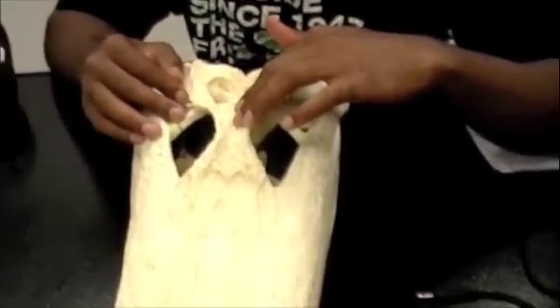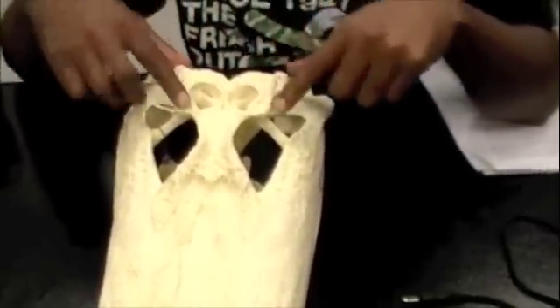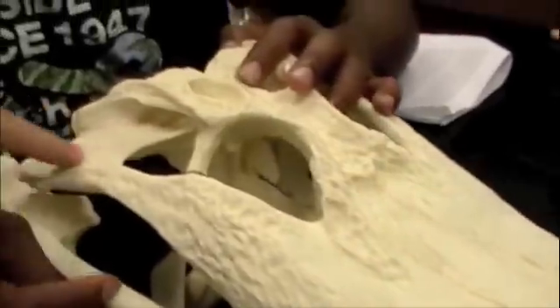And the parietal's behind it. Right here? Yep. And the quadratojugal — that's over here?